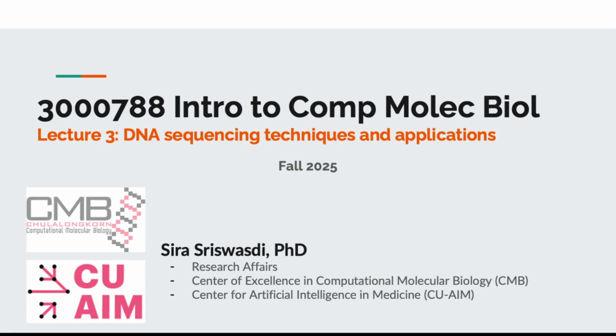So today is the third lecture for this Introduction to Computational Molecular Biology course. And today we are going to talk about DNA sequencing. Many of you probably know about DNA sequencing before, but today we're going to review all the techniques from the first generation to the third generation, and then look at some applications, some molecular assays that we can do with DNA sequencing.